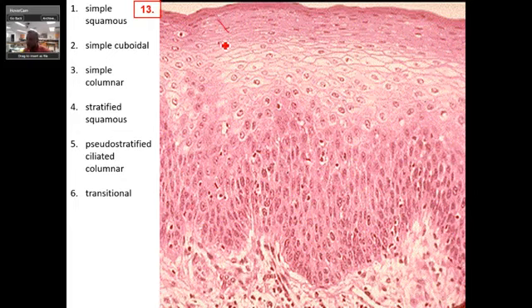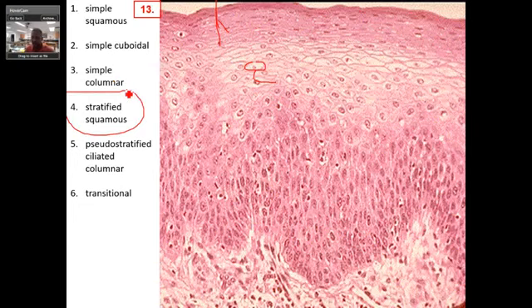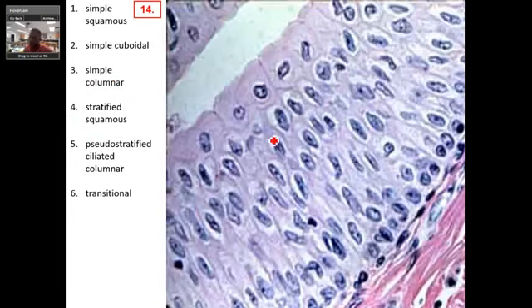See this? From here down to here, these are all squamous cells. You can even see the squamous, the squamous, the squamous. Some people like to say squamous, tomato, tomato. All right, but you remember your apical surface is your determining factor for telling if and what type of stratified layer you're looking at. So again, that last one was stratified squamous. Okay, I think this is my last one, and this, believe it or not, is actually another transitional one. Some people might mistake this for cuboidal, but you see all these shapes here. So this is unstretched.